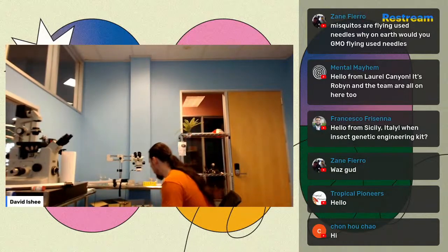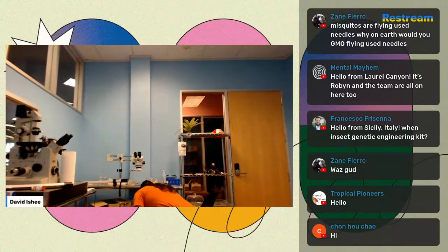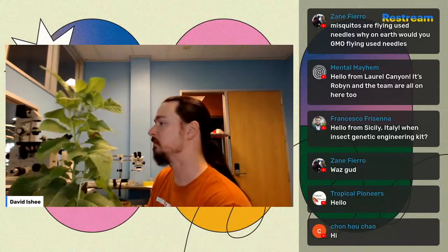where we can test out things really quickly because it only takes a few days, 3, 4, 5 days. Everybody who did this along with the class last time should have some patches, and they should look something like the ones we showed, maybe something a little less organized, like this one. This is one I did a while back. And so these were done around that same time. You can see.